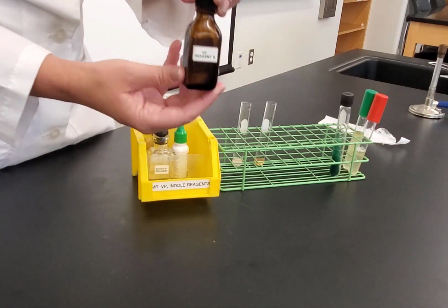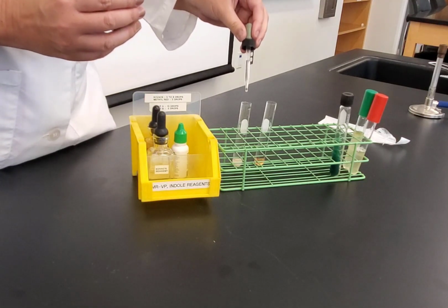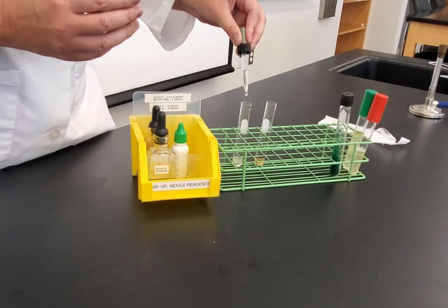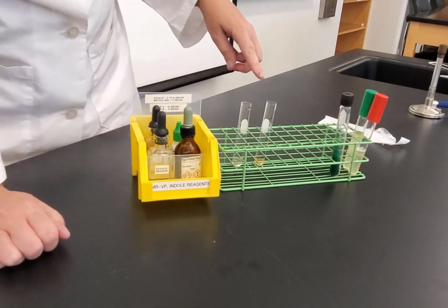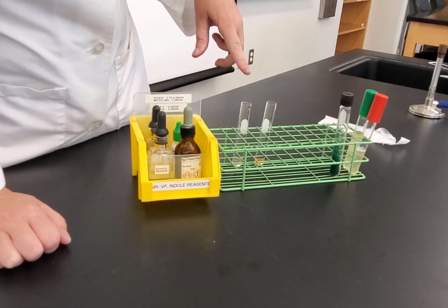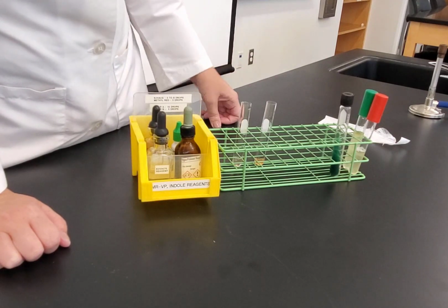Now I'm going to use my VPB and I'm going to add 5 drops. 1, 2, 3, 4, 5. And then I'm going to let those sit. So my methyl red, the readout can be done right away. VP though can take up to an hour. So the VP has to sit for a little bit before you can do the readout. The MR, generally you can do the readout right away.